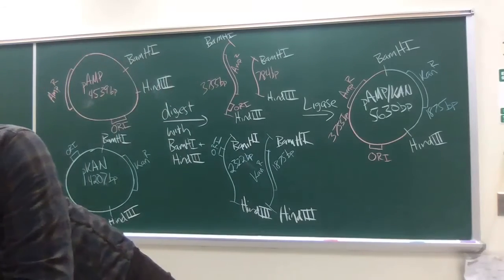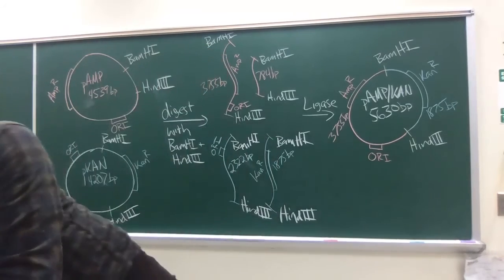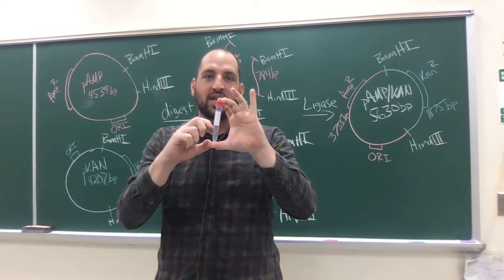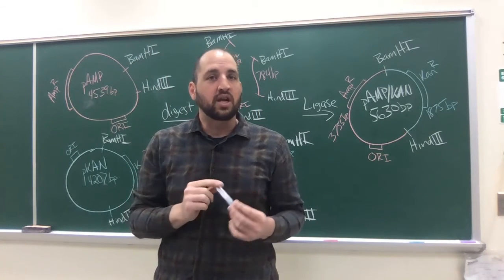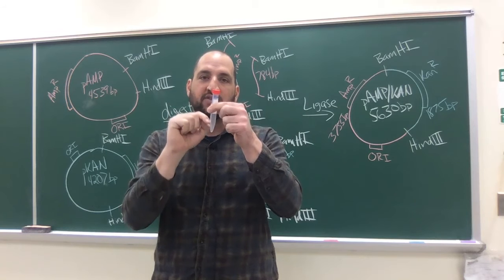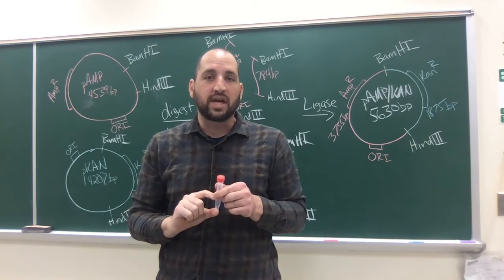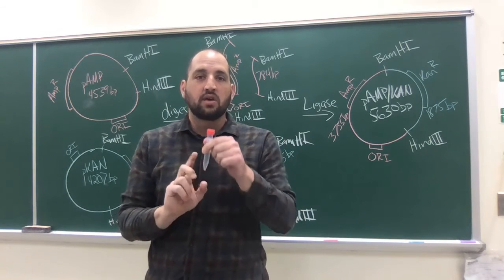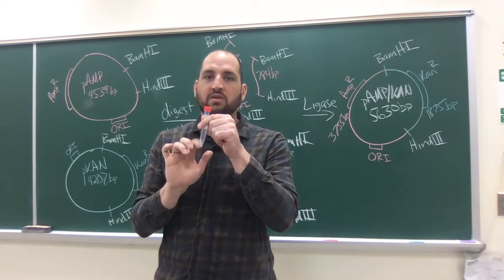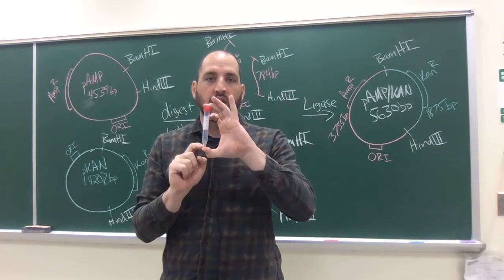If you were here, you would have a tube that looks something like this. We would put this tube with your cells in it into the clinical centrifuge and spin it at relatively slow speed. That would collect the cells at the bottom, and there would be media left in the tube. We would then dump the media out and add some cold calcium chloride to those cells. We would flick to resuspend the cells. Sometimes this pellet's a little bit tricky, so we might have to use the vortexer to get the cells back into solution. So we've got cold calcium chloride on our cells now.